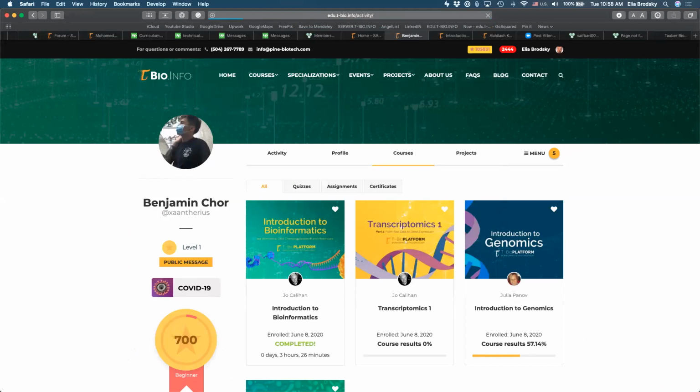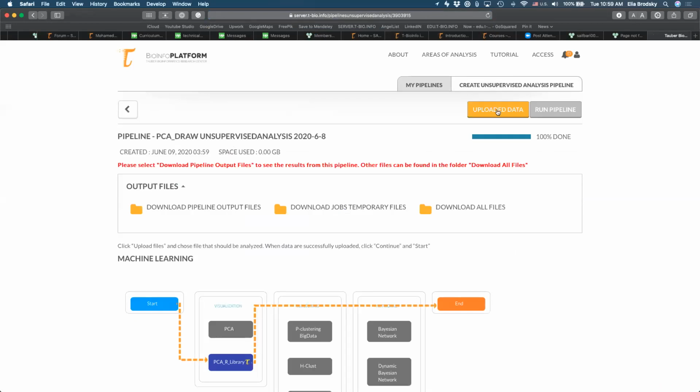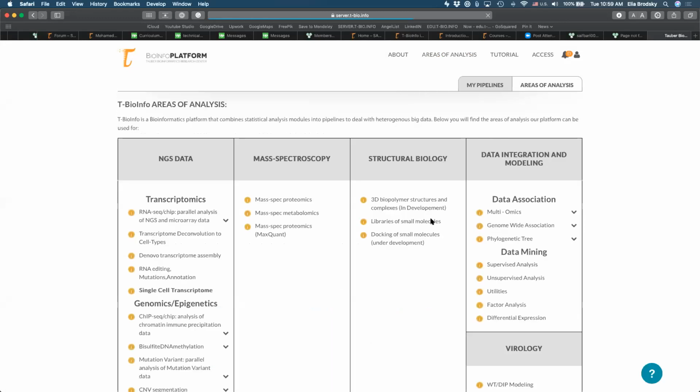And those issues can be addressed, and we can tell you about the files that you have uploaded. For example, if something was wrong there, or if some setting was wrong, and things like that. So really, this is a way for us to interact with you, knowing what's going on. Once you are done, as I mentioned, a lot of these methods are linked, so you can find that method, you can download it, and then you can install it on your computer if that is what you would like to do.